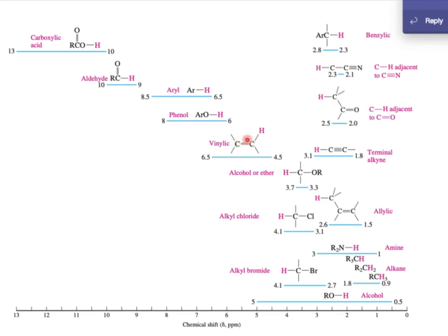Olefin also has a pulling effect, right? So that's why all the electrons revolve around these pi electrons, right? So as a result this hydrogen will be de-shielded. That's why it comes at the high frequency de-shielded region. The same phenomenon applies to this aldehyde and carboxylic acid.